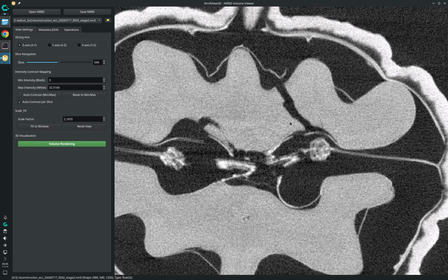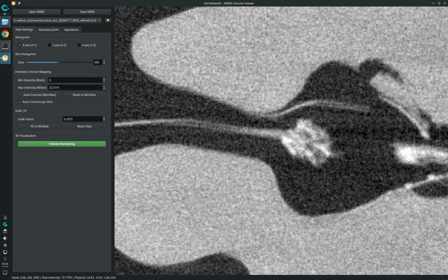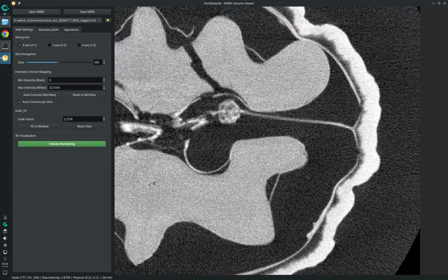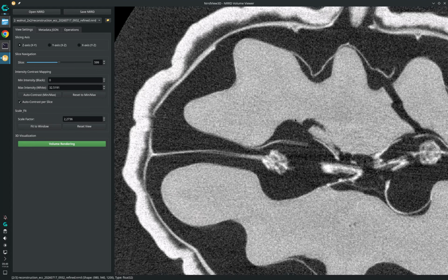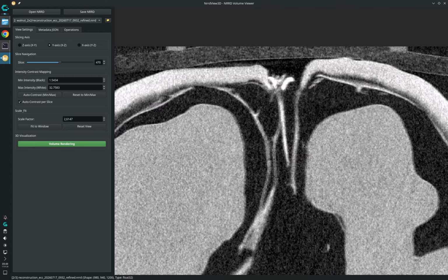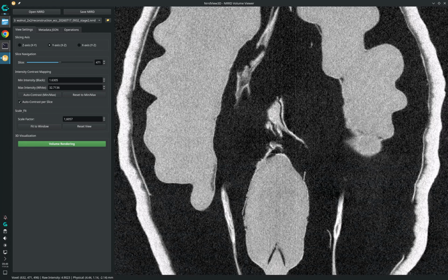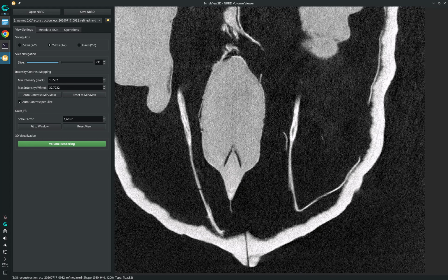And you can see that there is a bit of difference, but I guess I was hoping it would correct for these misalignments here, and it didn't. When I tried this earlier, I guess I had the settings a little bit differently. It actually did a better job at this, but you see, you have to play with it a bit. I mean, it definitely gets sharper, so I would say that it improved, but not by as much as I was hoping.